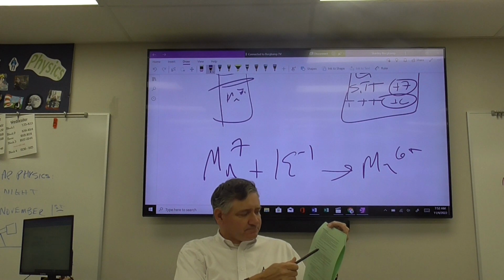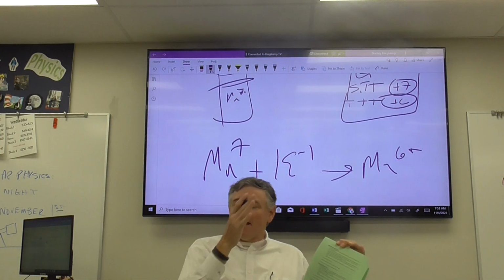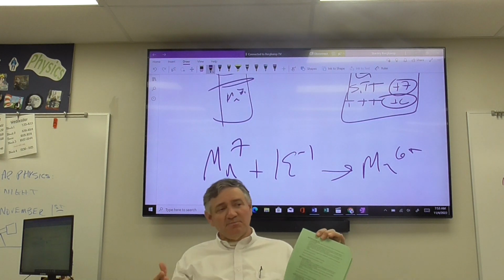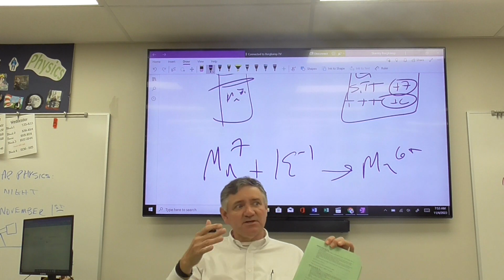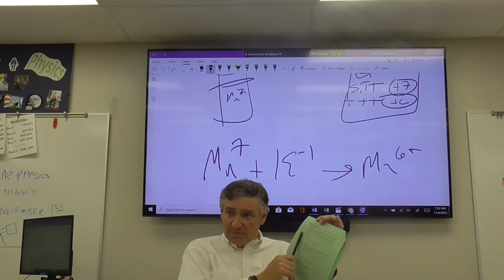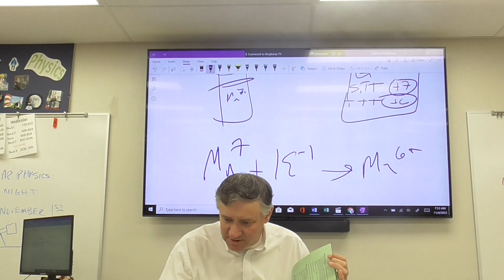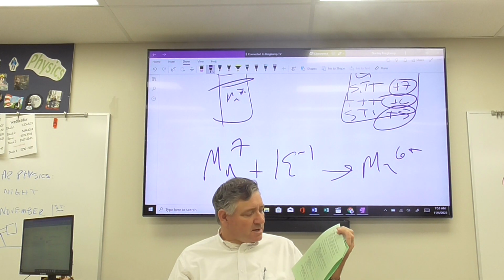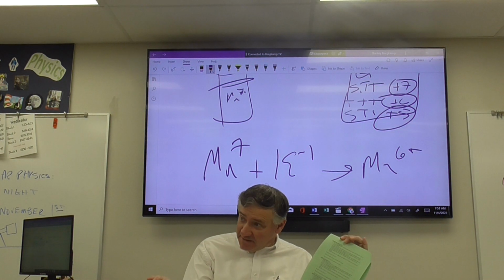There are some conditions there. And again, I can't say exactly what you're going to do, because it depends upon how much potassium hydroxide you have. So there are some conditions about how you're going to handle this. And again, you're going to put this into a short test tube labeled Mn5+. So you can have a short test tube labeled +5.